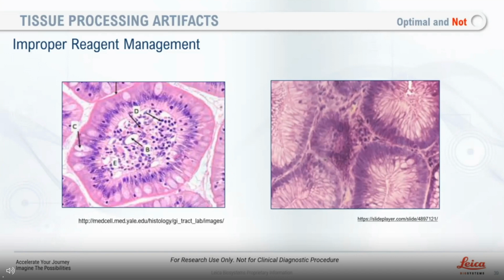Right. Next question. What is the single most important step to ensure that optimal tissue processing takes place within the chosen platform every time? Oh, I think if I knew the answer to that, I would be retired. That's a great question. I think I can speak to maybe a couple of things. I think it's a 2-part question.